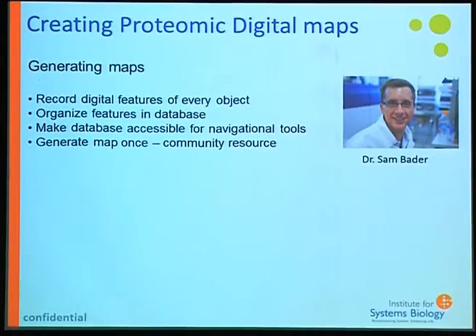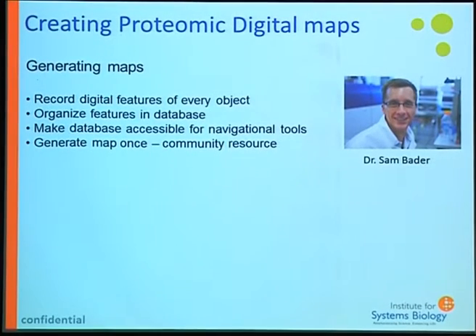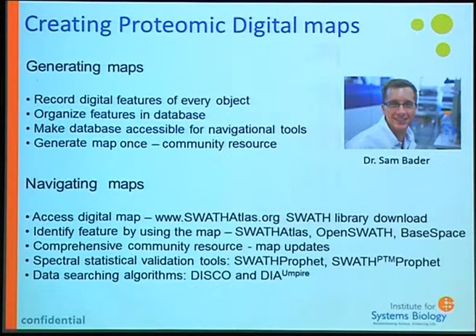Sam will go through all of the aspects of taking the data that's been collected, how to collect that data, and then process it through the SciEx software. So he's going to go through this, because this is the software that you'll get if you're running an AB SciEx instrument, and creating these libraries and analyzing with those libraries and utilizing some of the resources.